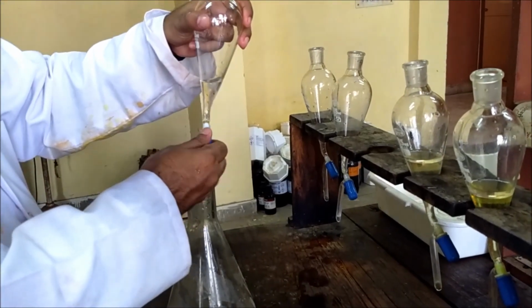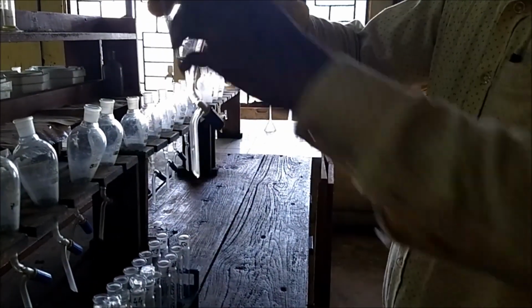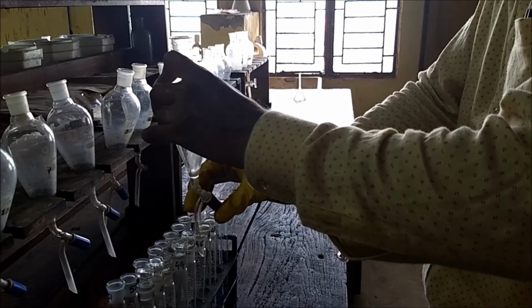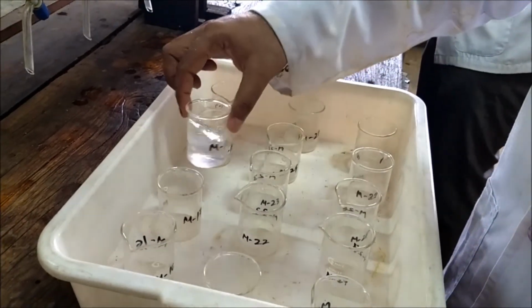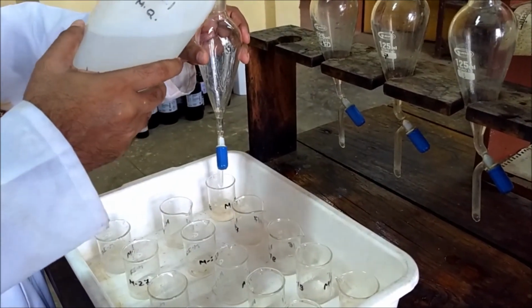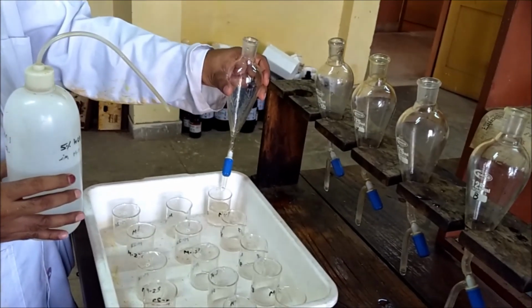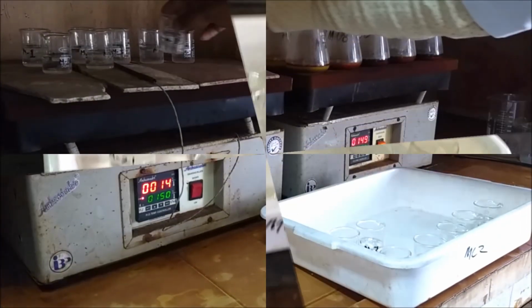Here comes the twist. If you want to detect gold at ppb level, then collect this organic extract into a test tube and aspirate in GTA. And for detection at ppm level, collect the organic extract into a 50 ml beaker followed by washing with 5% HCl solution and make up the volume to around 25 ml. Now, we will be showing you the extended procedure for detection at ppm level.